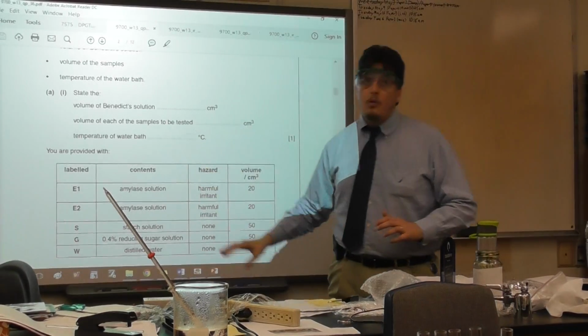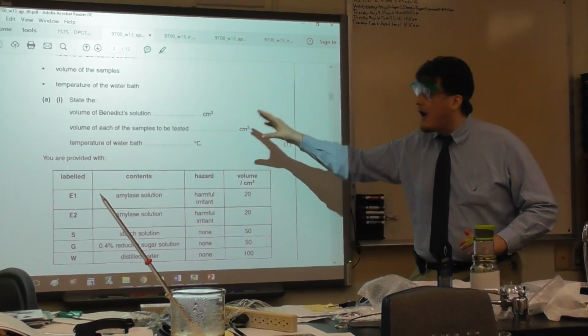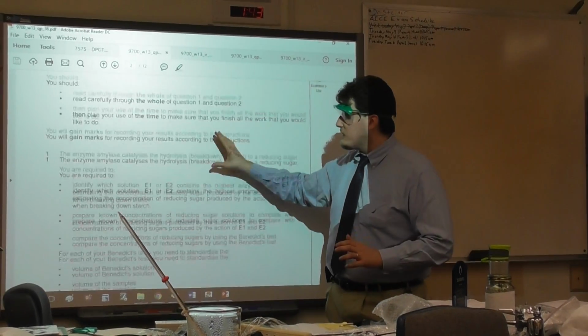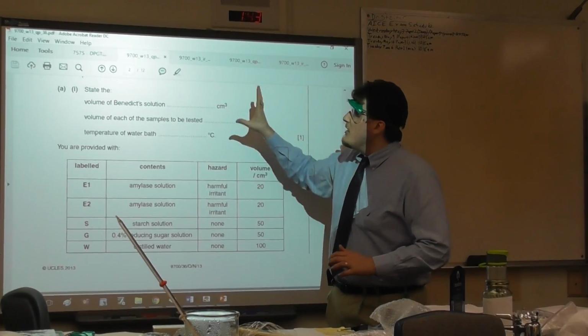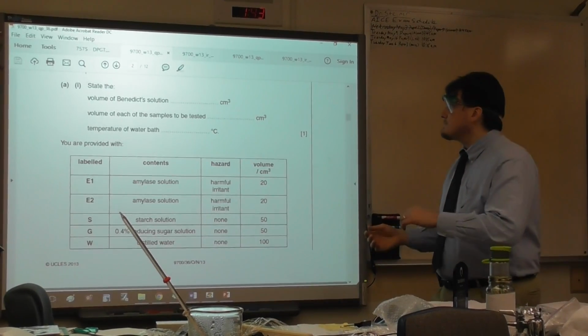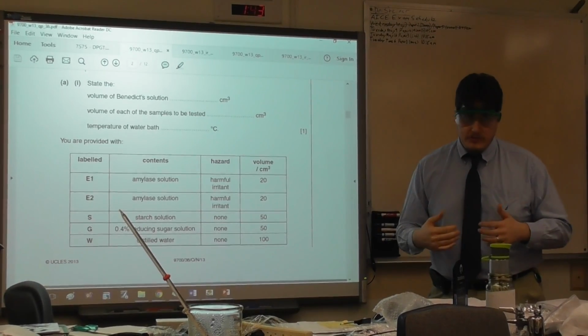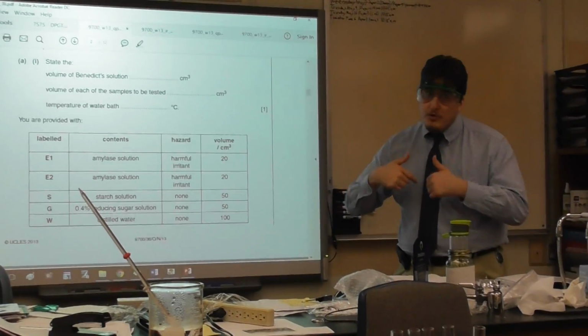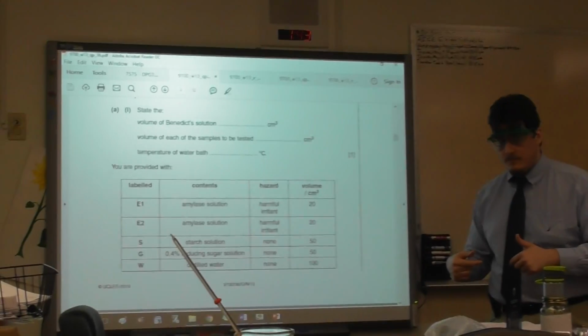And the temperature of the water bath is based on how the test is done. So there is a right general answer here, but there is no specific right number. Now, I know what I would choose. Pause the video, decide for yourself, and then I will say what I would choose.